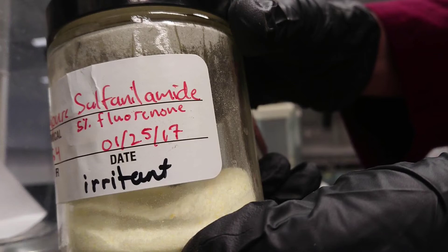In Part A, we will purify a sample of sulfanilamide by performing a recrystallization.